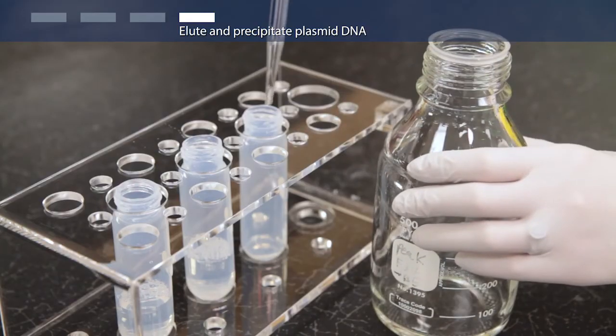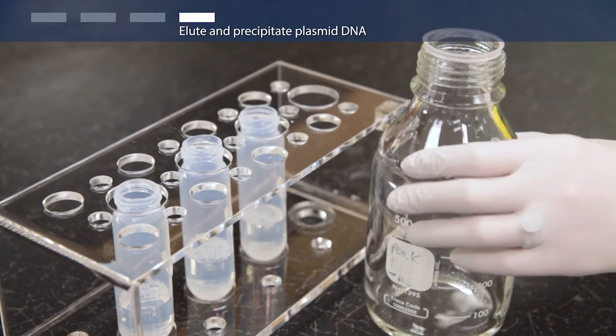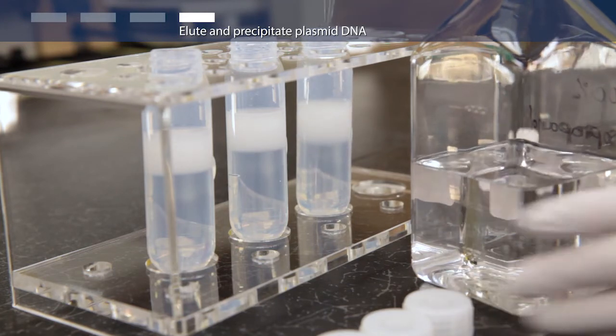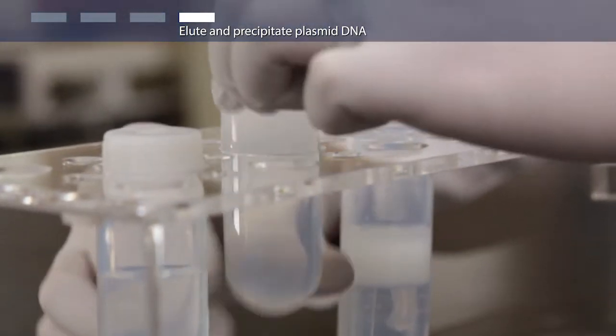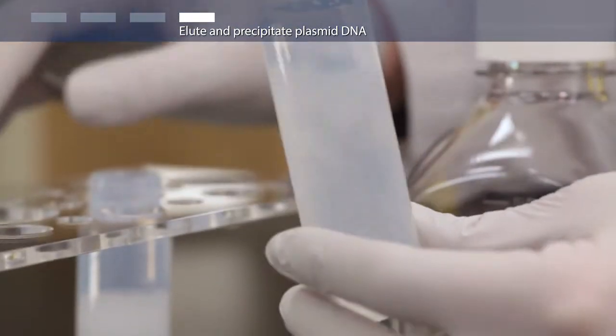Transfer the eluate into 30 milliliter centrifuge tubes and add 0.7 volume of isopropanol per volume of eluate. Mix by gently inverting. Centrifuge at greater than 12,000 times G for 30 minutes at 4 degrees Celsius.